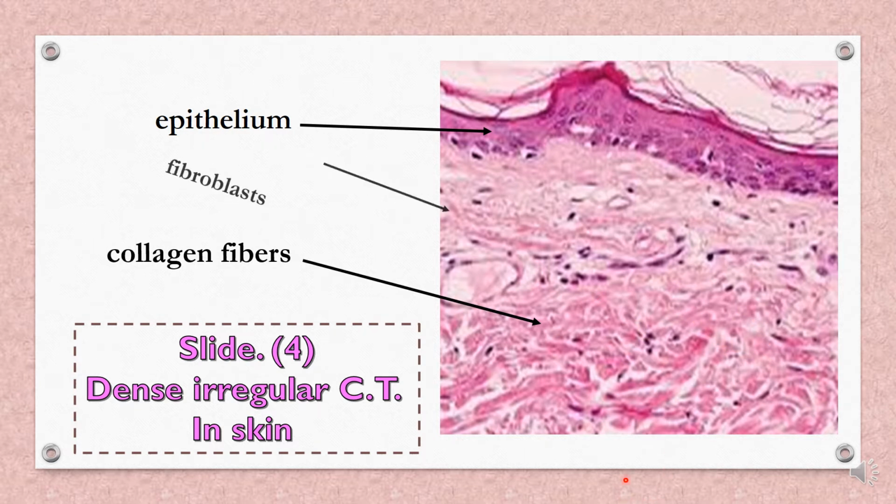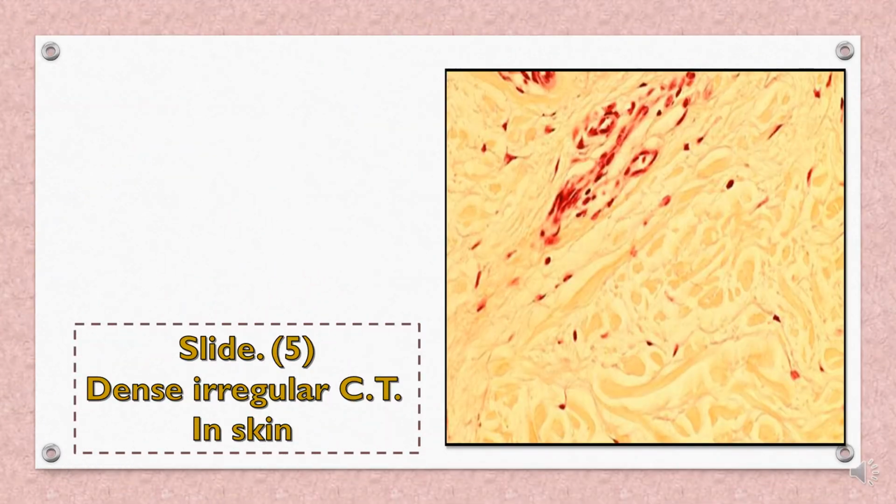Also containing fibroblasts. These are fibroblasts which are numerous in this tissue, which found in the ground substance. نلاحظ كمية ground substance, very little amount as compared with collagen fibers. نلاحظ اللي هو المكون الرئيسي in this type of tissue. أيضا هذا section بالسكين لمثل dense irregular connective tissue. نلاحظ also these are collagen bundles in different direction باتجاهات مختلفة.